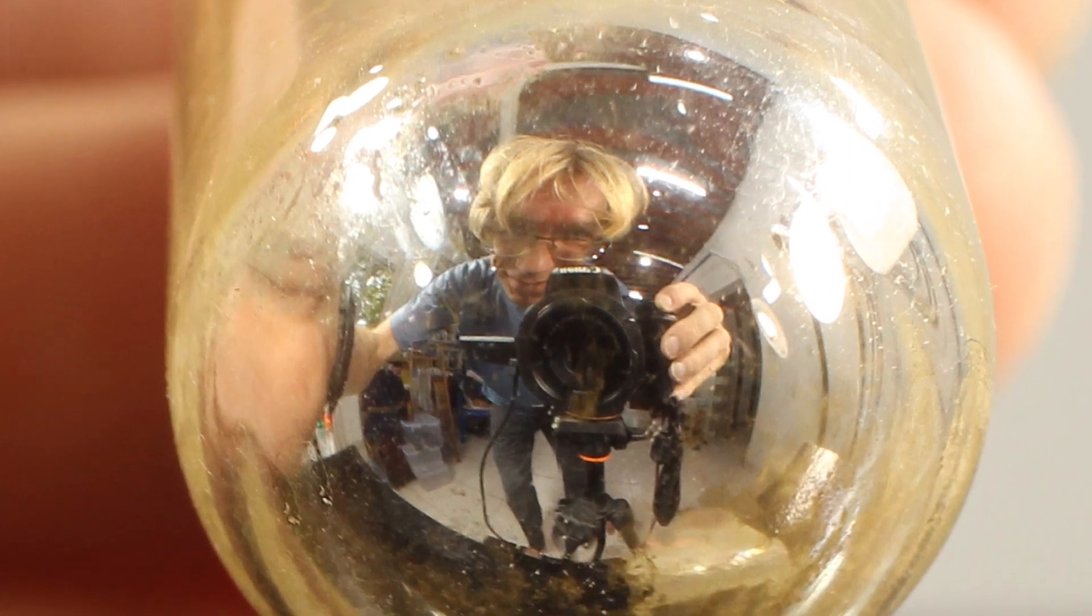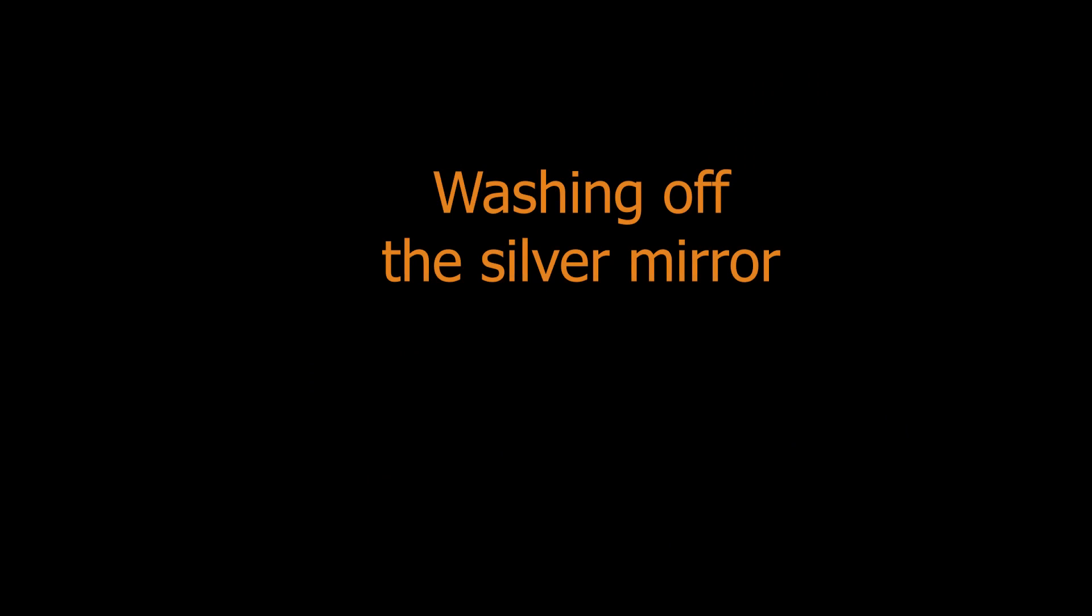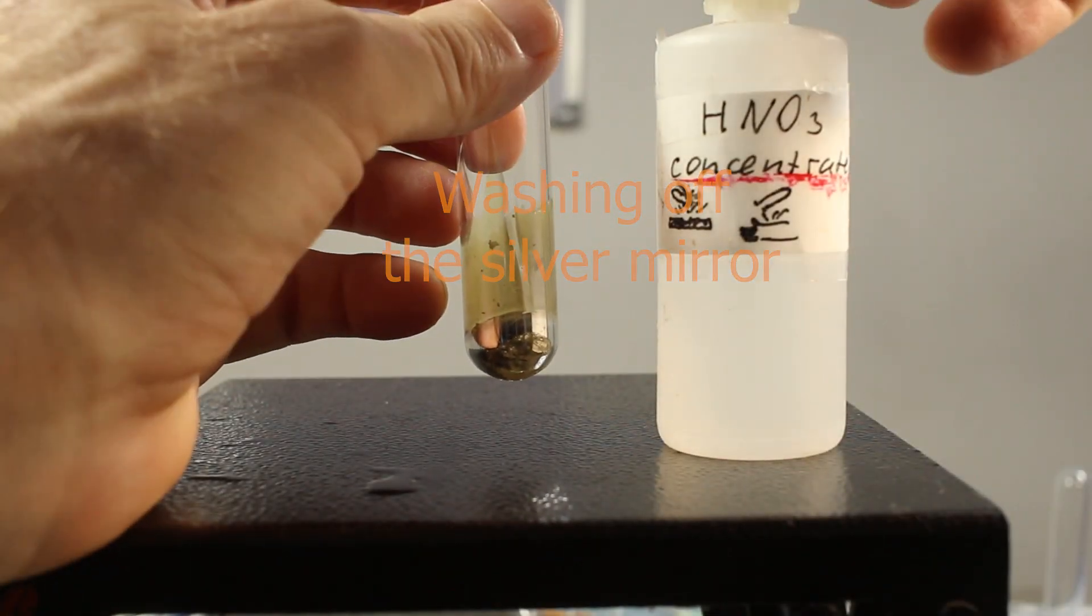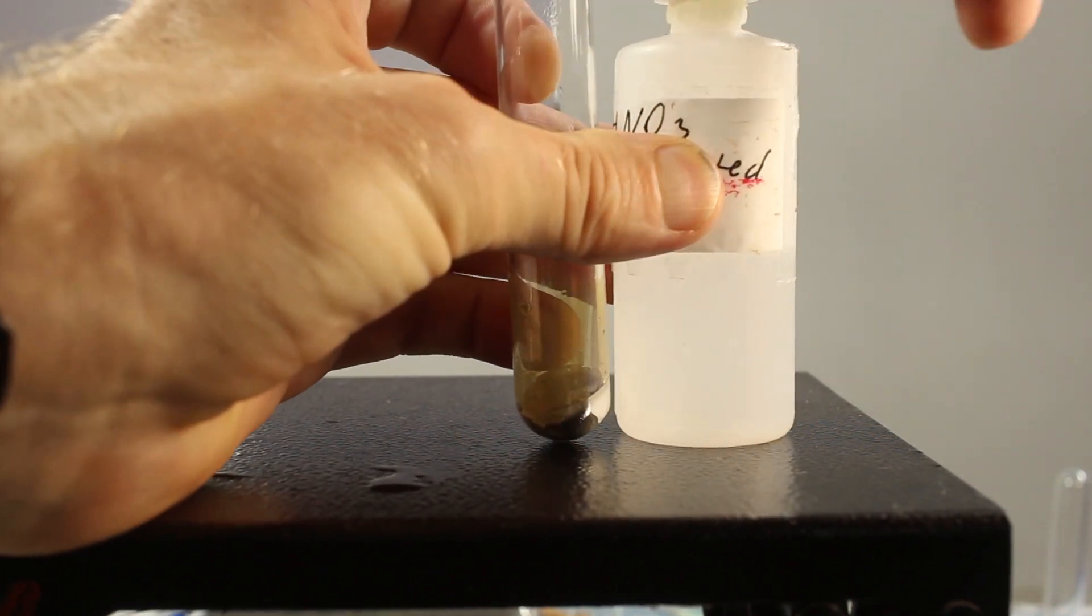Okay, but after each test, we have to clean up. And silver mirror is quite persistent sometimes. What do we do? Our best friend, concentrated nitric acid.